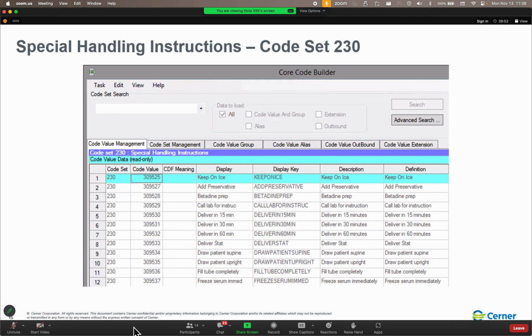Okay. So folks, at this point on slide 25, every one of us has been assigned an orderable. The orderable I'm going to be working with, because I am DL16 this week, my orderable is the vitamin D25. So folks, at this point, I want you to write down the orderable that you have been assigned on this slide. Again, it's per DL number.